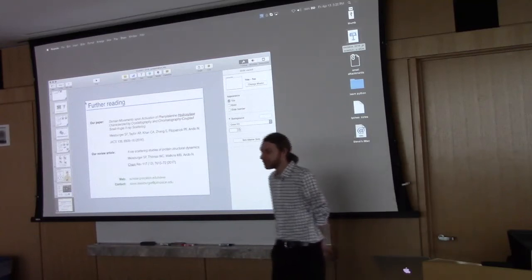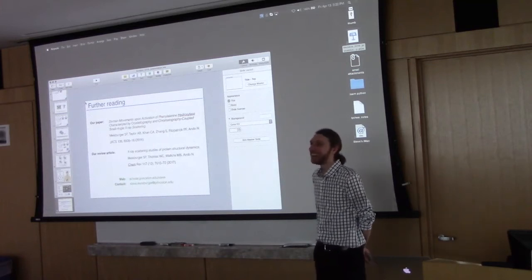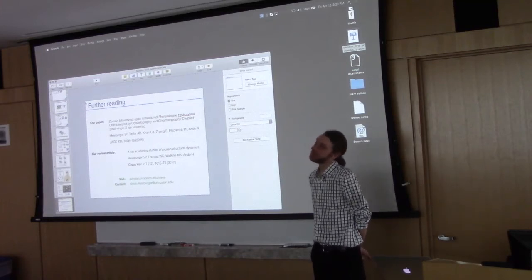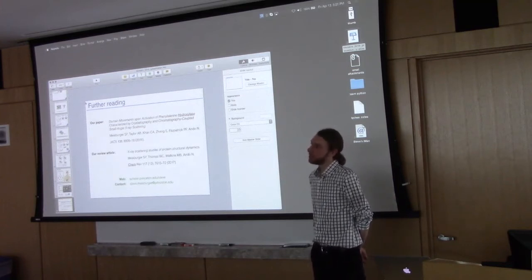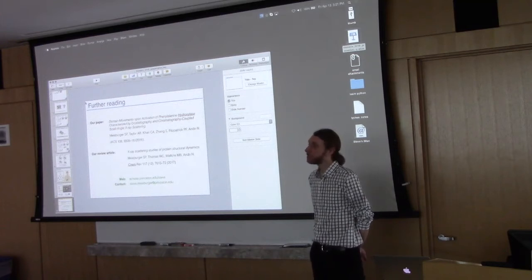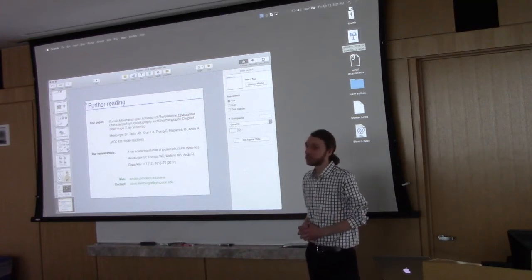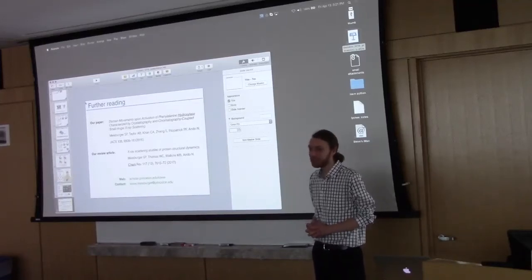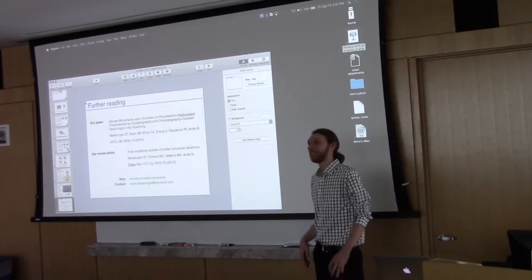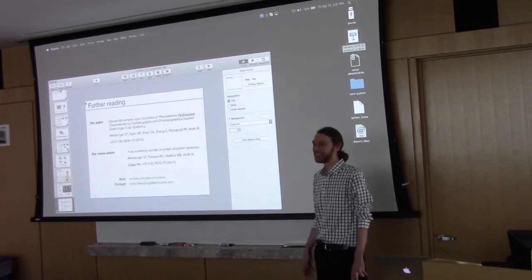Yes. For this particular project, how many synchrotron trips did you make? Well, for the data that ended up in the paper, that was probably maybe 3 synchrotron trips. Plus, we got quite lucky. We went through multiple review cycles, as you do, and a reviewer requested additional data. And it just turned out that we were able to get beam time at the last minute. We were able to go and collect the data, and we turned it around in just a few weeks. So sometimes you can do stuff like that. But yeah, that was multiple trips.